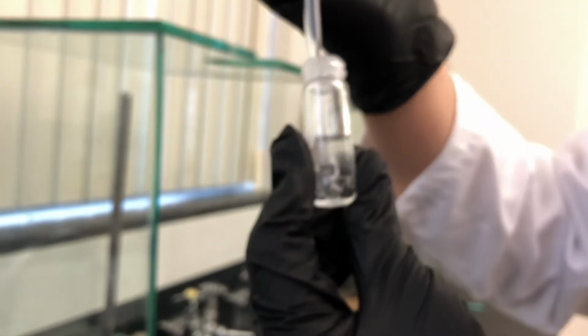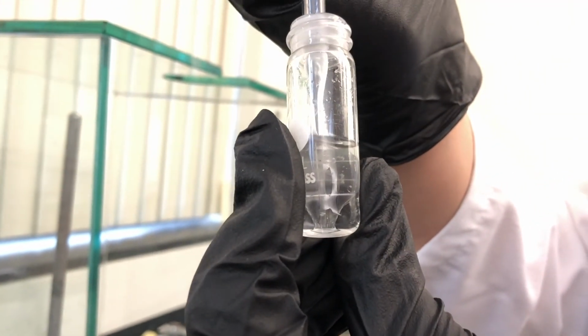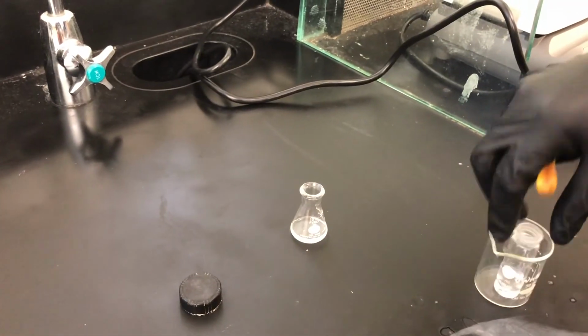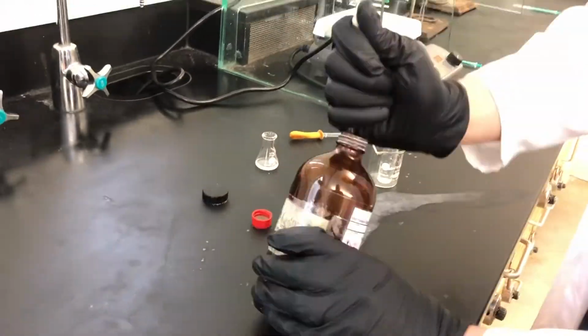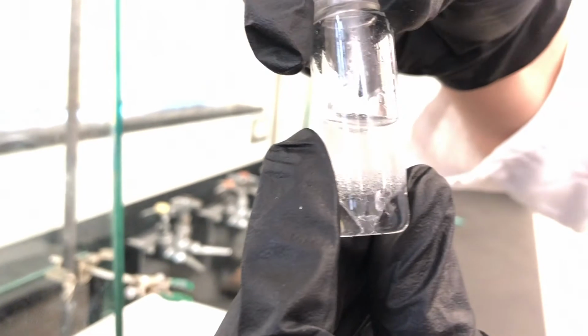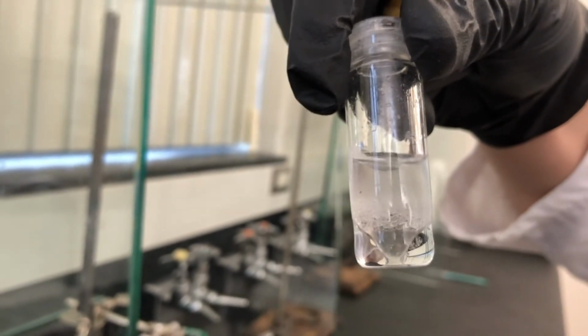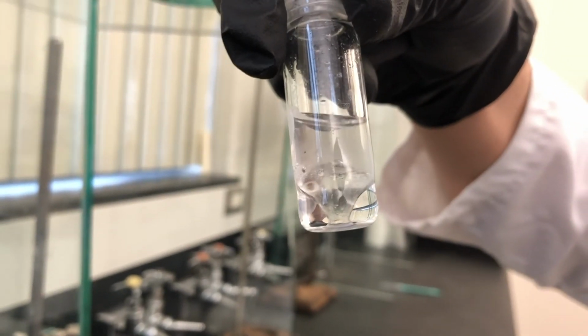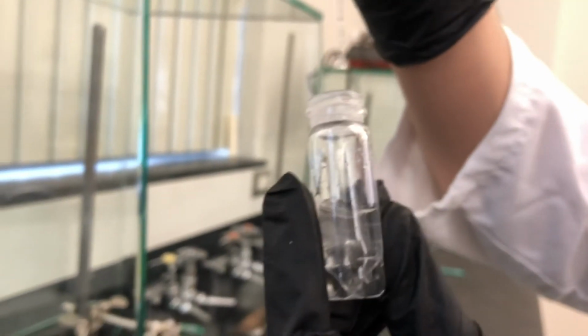So we're going to put the bottom layer into the 10 ml Erlenmeyer flask. Do that one more time. Let that settle. And then take the bottom layer.